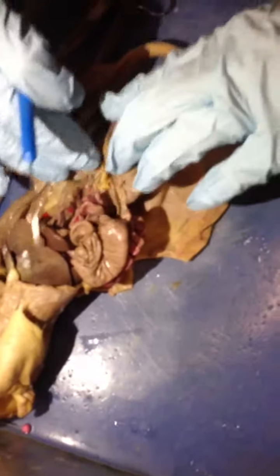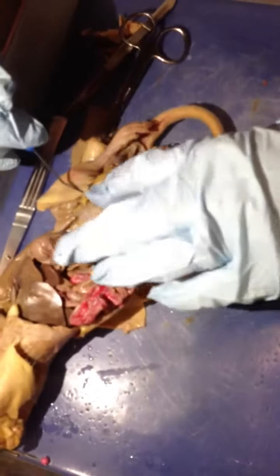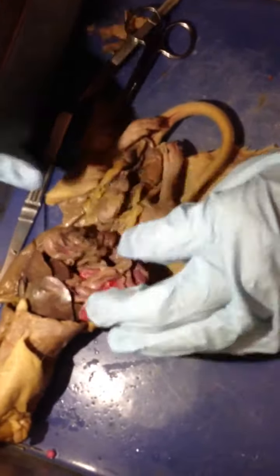Okay, then I think we can go into male. Alright, hold on. Oh. I'm going to restart a new one. Okay. Alright. So, let's see.